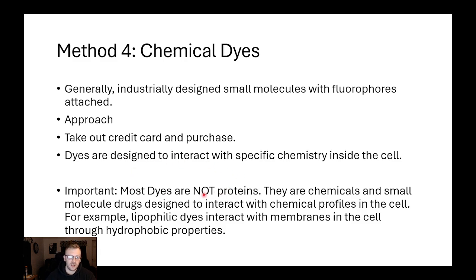And like I said, I've highlighted down here. Dyes are not proteins. They are chemicals and small molecules that interact with chemical profiles in the cell. But one of the really nice things about dyes that can make them very powerful when used in conjunction with more specific labeling techniques is if you have like a lipophilic dye, and I use that as my example a lot because I use one. It's called DiO. A lot of times they're cell permeable, right?